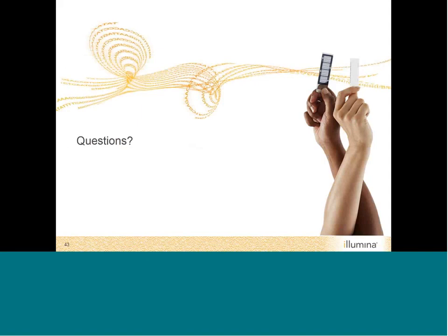Okay, so first question, is there a minimum read length for my Amplicon? So there is, when it comes to the analysis, some of the workflows do have technical limitations. So for instance, the TruSeq Amplicon and the Amplicon DS workflow have a minimum of a 50 base pair read length. But besides that, of course, we just want to make sure that we choose a read length that's appropriate for your project.